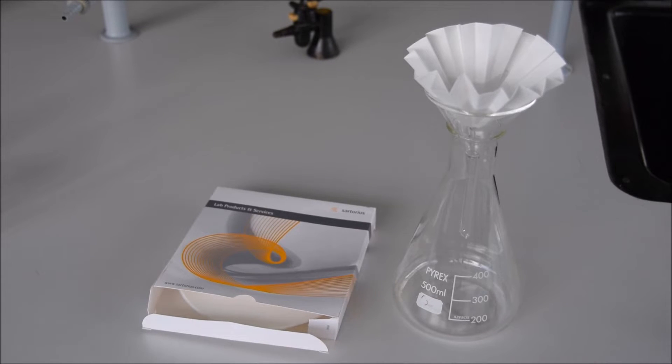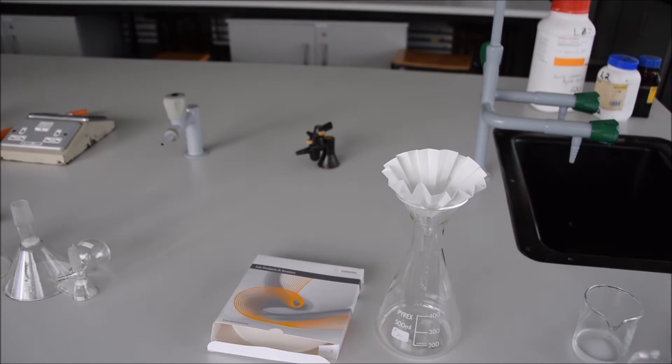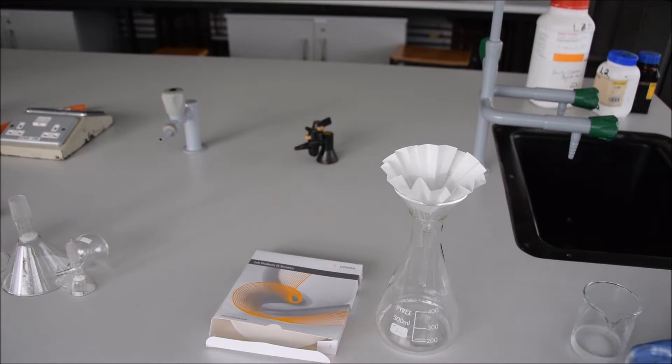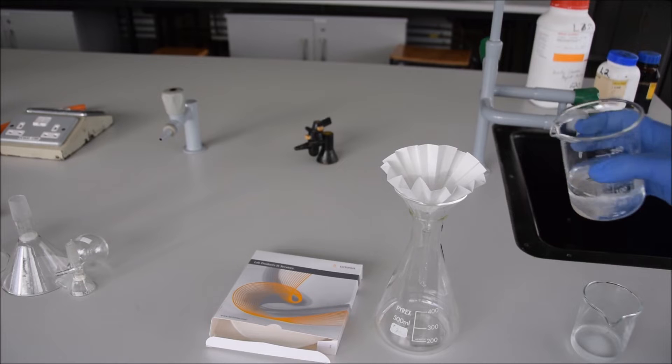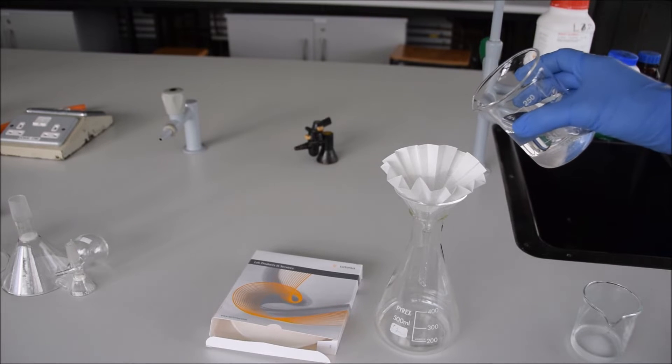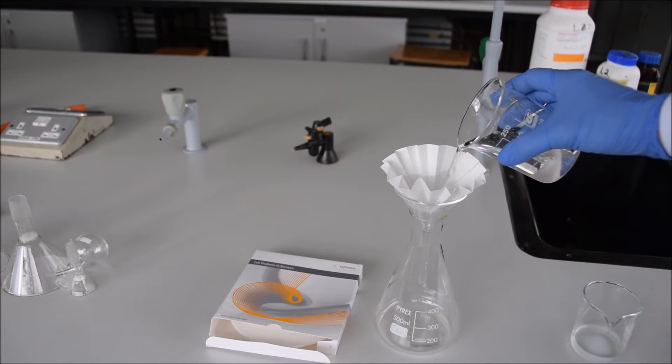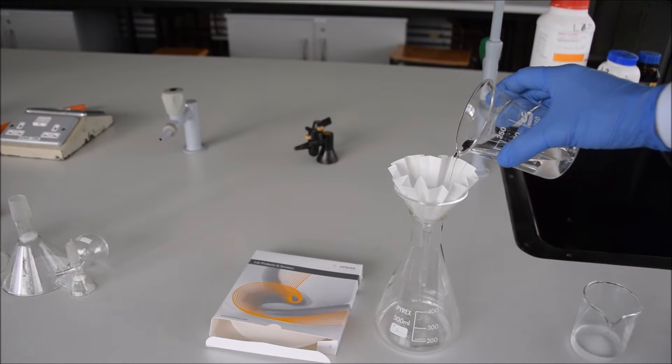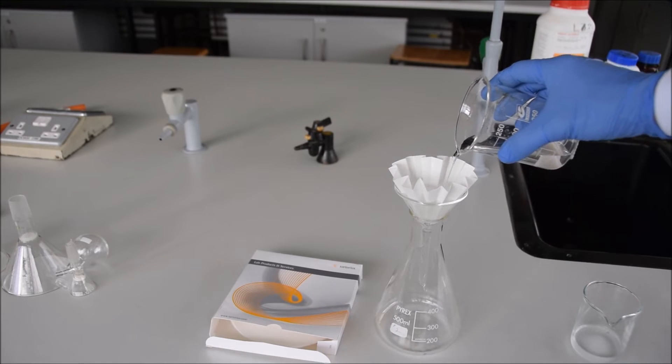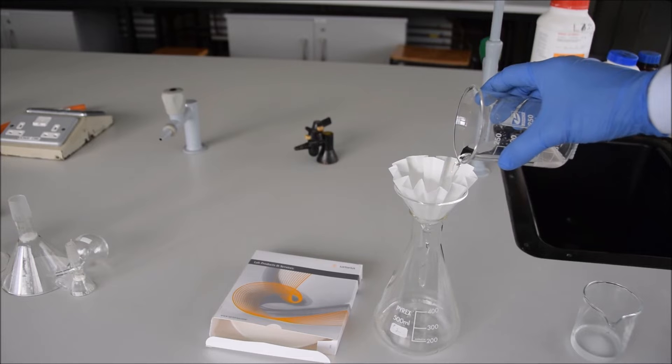It's also great when you have hot liquids you're trying to filter because there's no vacuum and so you don't boil your solvent as it goes through the filter paper. It allows it to stay hot and things don't come out of solution, and that's going to be really important when you're doing your recrystallization because if you've got hot liquid you don't want it to cool down as you're filtering it.